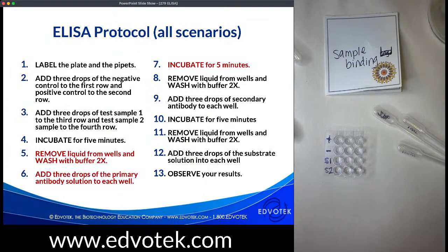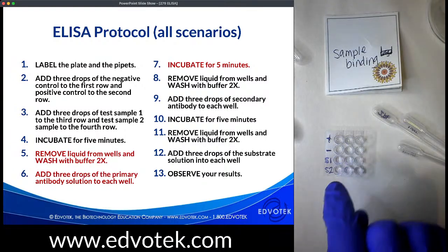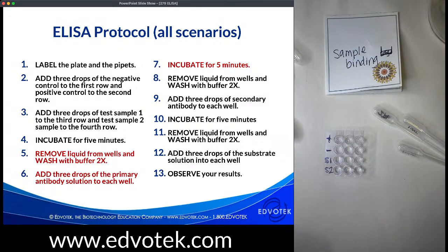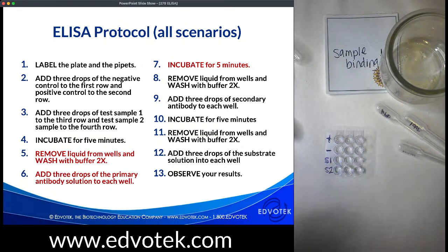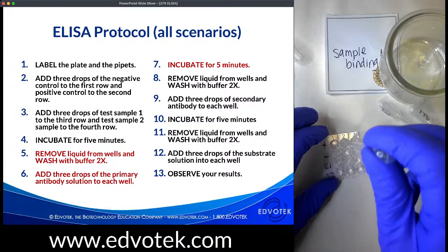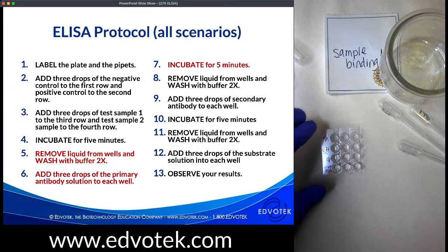All right. And so we're going to head to the next step of our ELISA. Our antigens have had time to stick to those wells, and we'll talk about what's happening in the well a little bit more in our next section. But what I'm going to do is remove all these samples. I'm going to put the waste in this waste beaker. And we want to be really careful to use the correct pipette for the correct well. So we're going to start here with the positive, and we're just going to remove all of this sample to our waste beaker. So that was our positive.